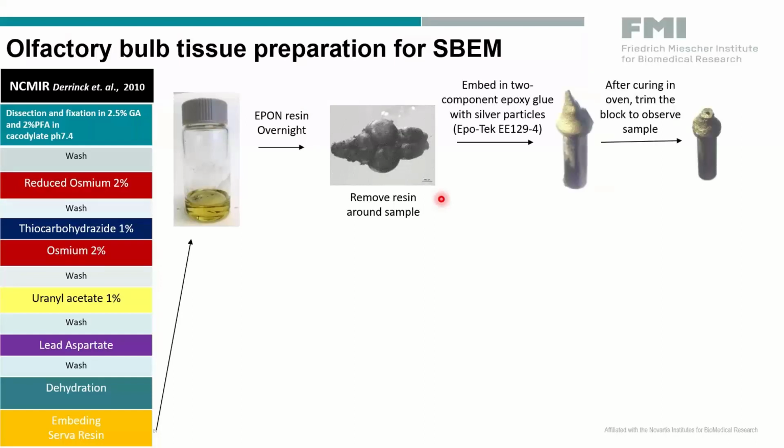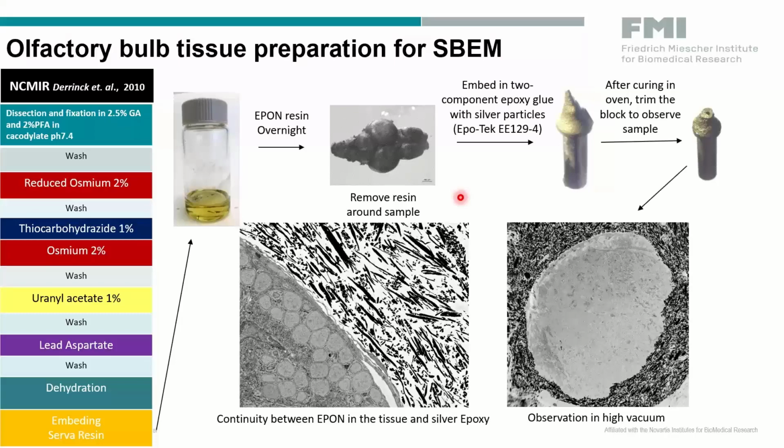In addition, we are embedding the sample in a silver resin or epoxy, and this also prevents additional charging that may not be cancelled by the sample preparation. After that, it's mounted on a pin, and we can start the acquisition.